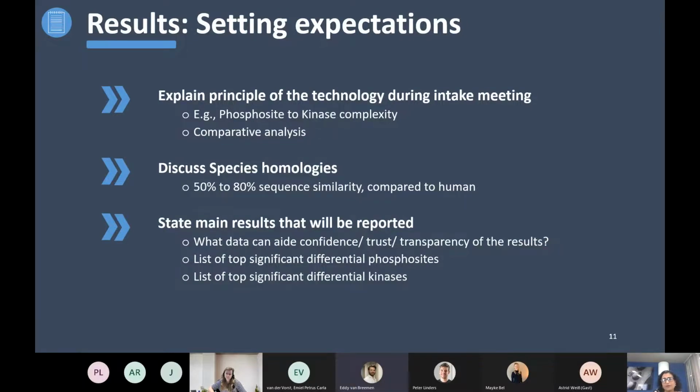But I think the question also originated, I remember that Astrid asked this question months back. So Astrid, I think you're happy also with the question from Sanne. The idea of an upstream kinase analysis for mouse, I think it's a great thing. Yeah, even people in other places in Germany, like Lübeck, have been asking about this. Definitely, it is in the pipeline, and we are hoping to have it done maybe this year. Also the chip. So it is in the pipeline, like I said. But for now, I also explained that the sequence is not just human, because it's based on the actual sequence itself.